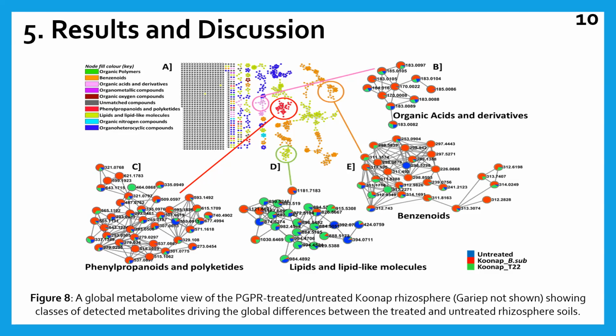the treatment of crops with this PGPR, Bacillus subtilis, could be a very important step towards providing crops with sustainable growth and development, as well as plant protection. They also say these metabolites are important in plant microbe interactions, essential in the recognition of parasites. It is essential for these compounds to be present in the rhizosphere in a case where the plant is experiencing a pathogen invasion, for instance a soil-borne pathogen in particular. These compounds alert the plant that there's an invader, and the plant can then produce certain compounds that attract the microorganisms essential for its survival in the rhizosphere.